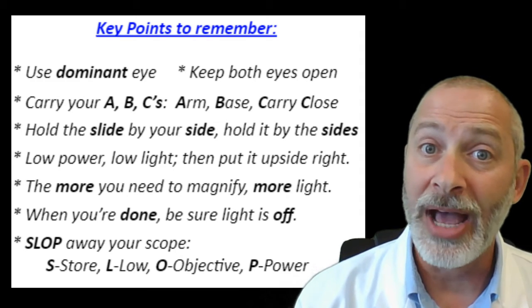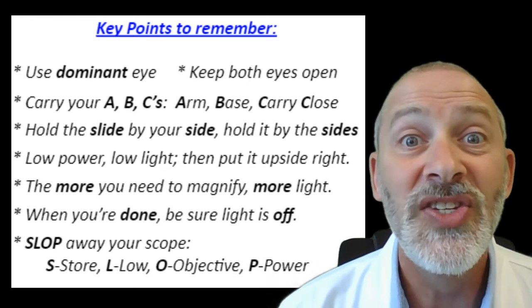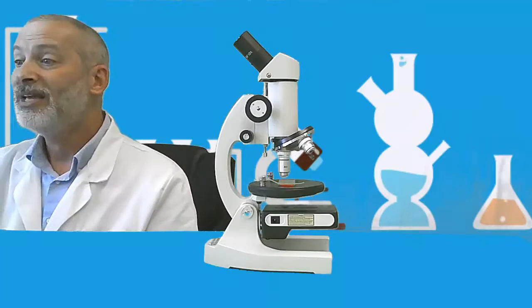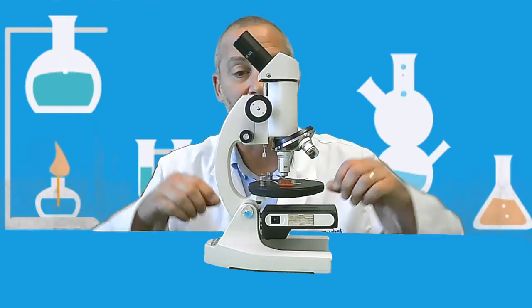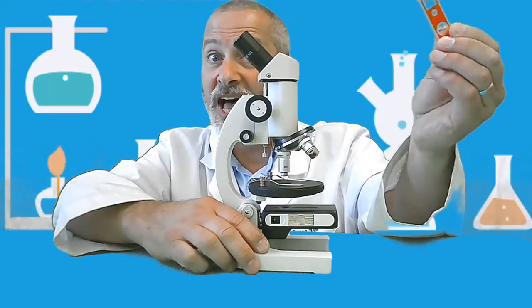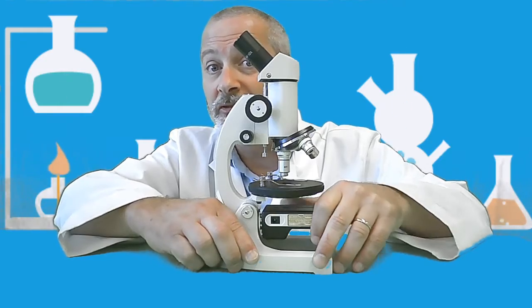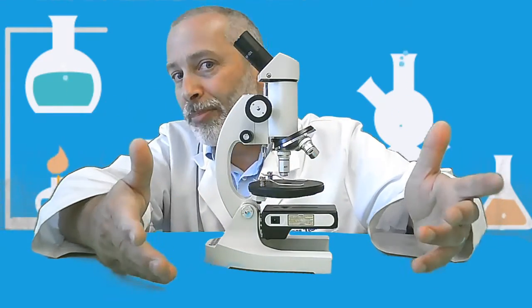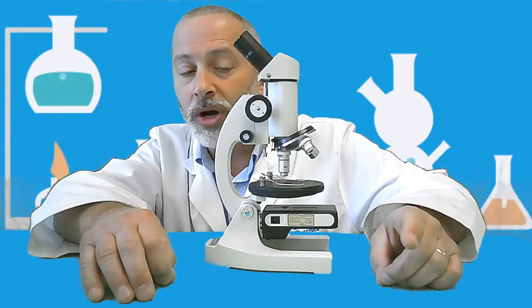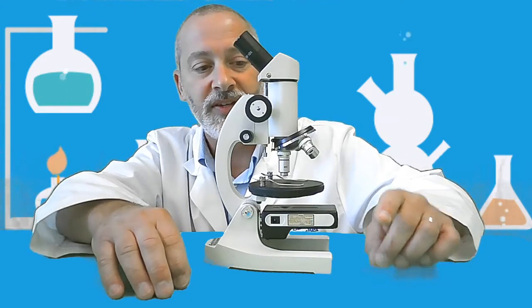Another thing I want to point out to you is this slopping away of your scope. Slop it away. What does slop it away mean? Well, let's check out the close-in view here again. Obviously, you will remove the slide from the stage and put it away correctly. The lamp will be off, and you want to slop away your scope. S-L-O-P. Store with the low objective power facing down.